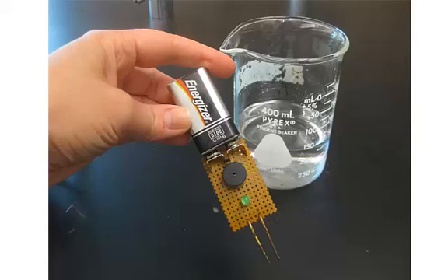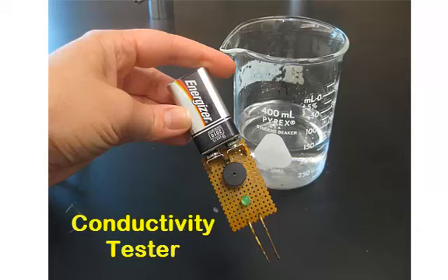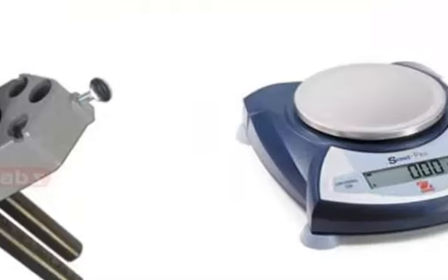You stick the prongs into the solution and if the light goes off, or sometimes it even makes a noise, I'll show you in class, then it conducts electricity. So whenever we're dealing with solutions that have metals in it, we can use the conductivity tester and test to see if it does conduct electricity. That's kind of fun.